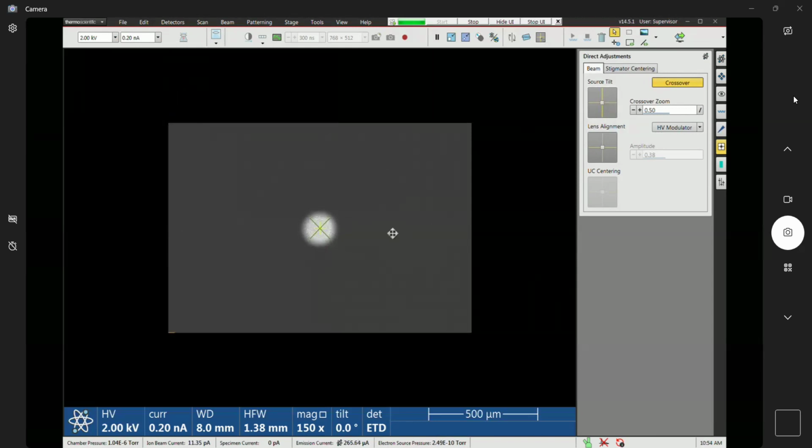Now even right here, you're probably going to see something, because we have enough of this centered. But obviously you don't want this; you want this well centered when you're working. Even if it's only a little bit centered, we're probably still going to see something in the picture.